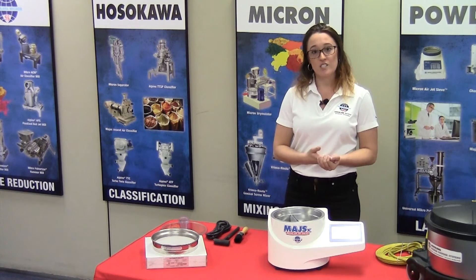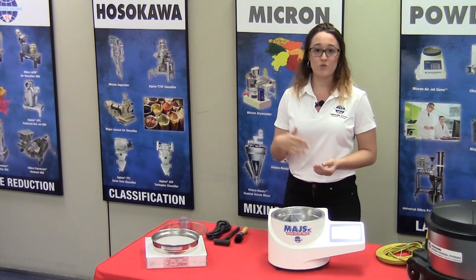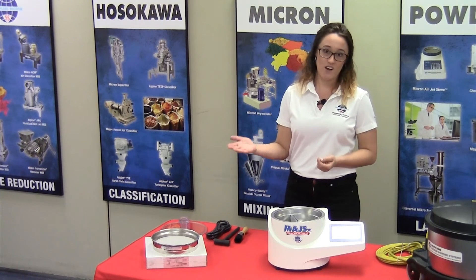We do offer test sieve screens ranging from the size of 20 microns all the way up to 4,750 microns.